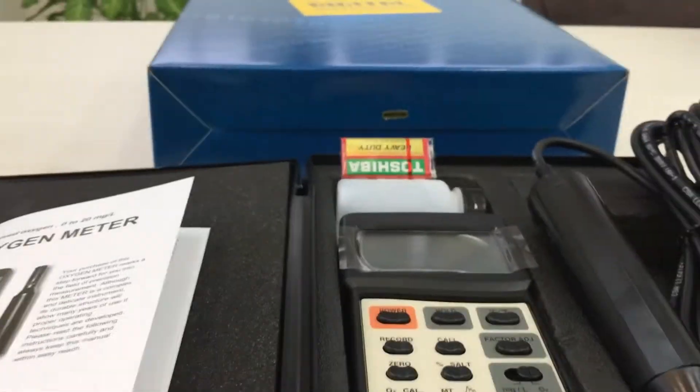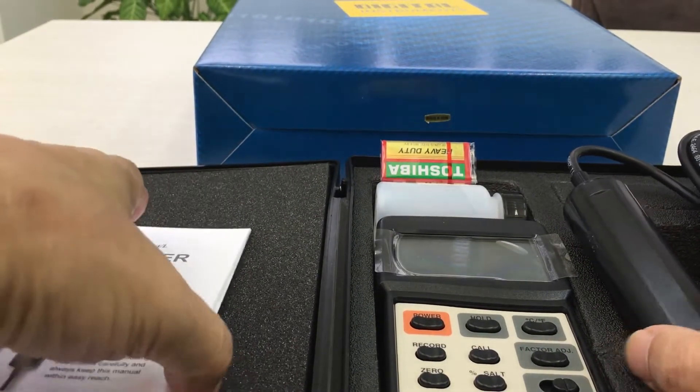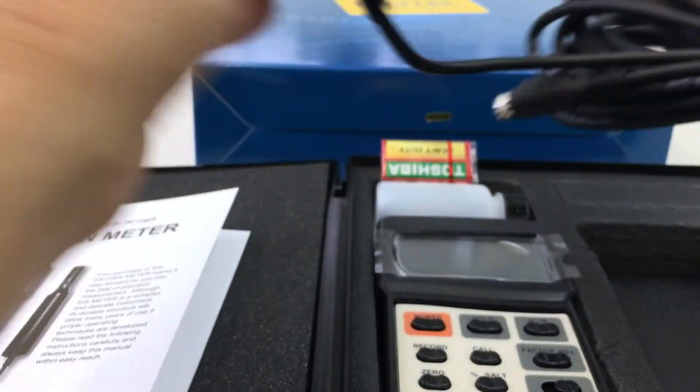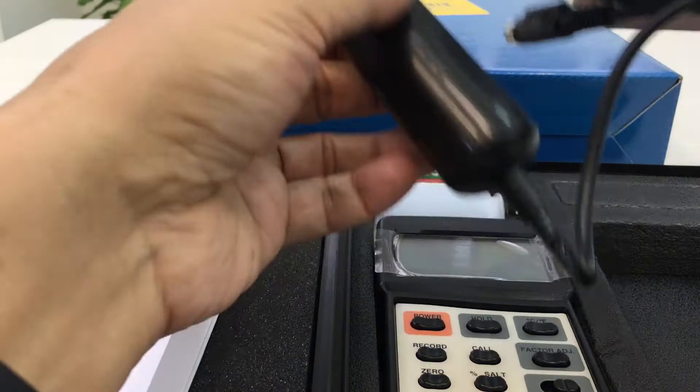This is for air measurement and water measurement. The cable here is 4 meters long.